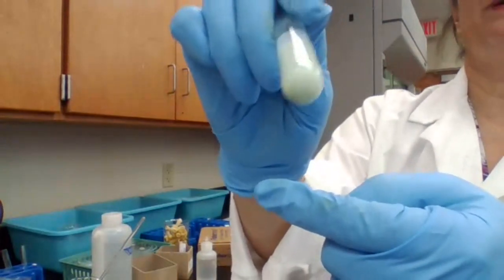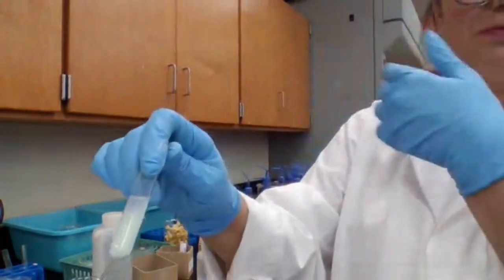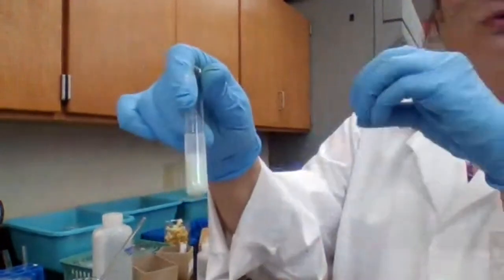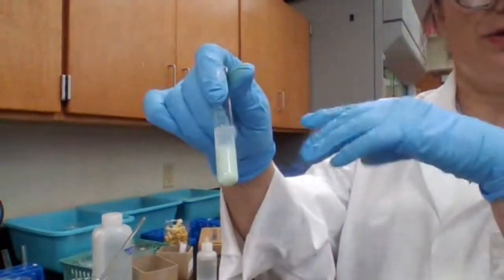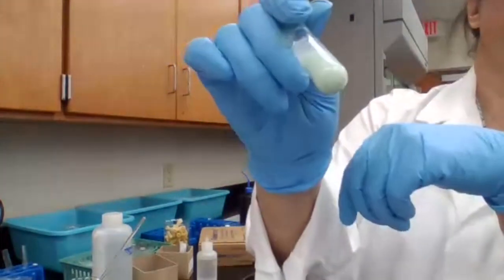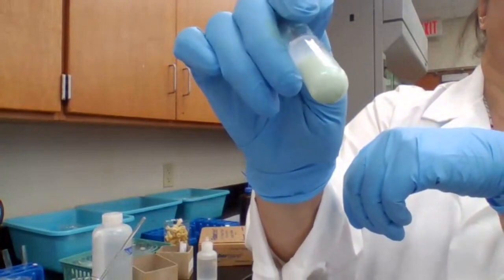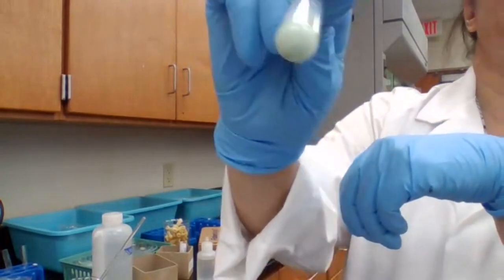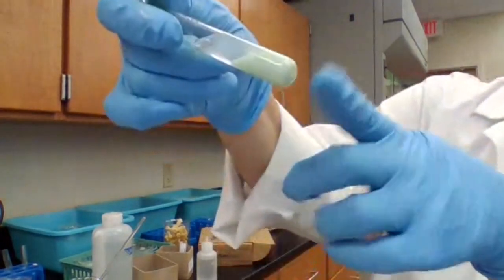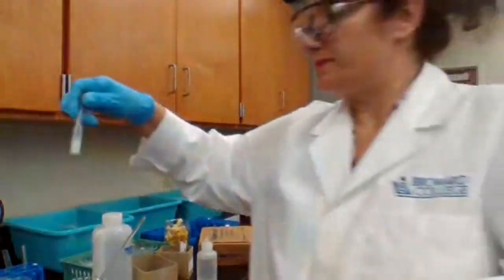Okay? It would be best for you to have a table ready, or have your lab notebook ready, and as you're watching, you record your observation, because you're not going to remember everything. So make sure you record your observation as you are watching the video. And the good thing is that you can replay it often. So the black particles here, that's presence of bismuth.